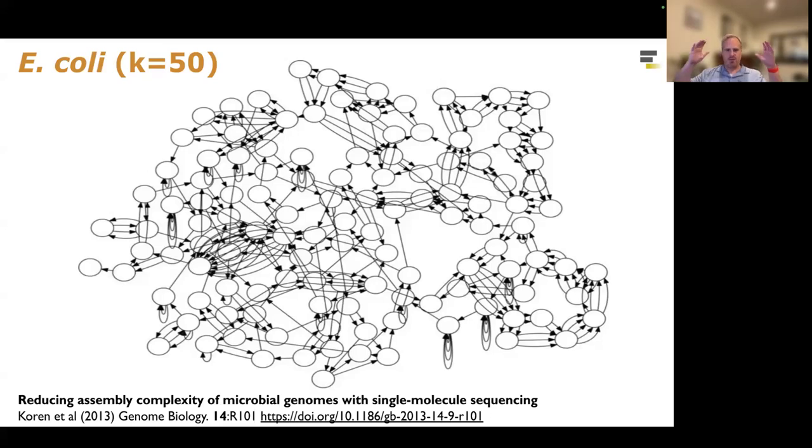So we're going to take the original full genome and extract the first 50 characters, and then shift it over by one, the next 50 characters, and so on. Do that over the entire 5 million base pair sequence. The initial graph there will be about 5 million nodes long because the genome is about 5 million bases long, although the little sequences upon them will each be 50 characters long. That'll be the initial graph.